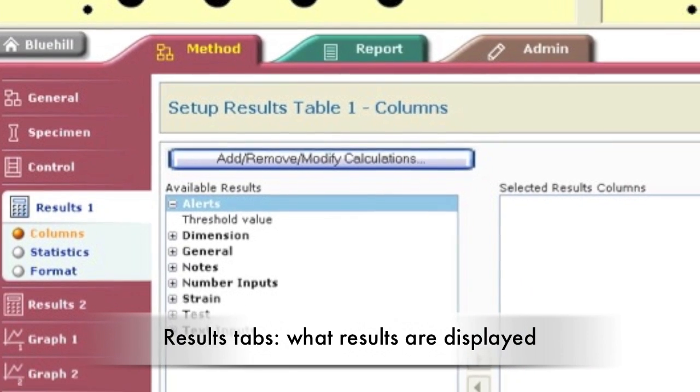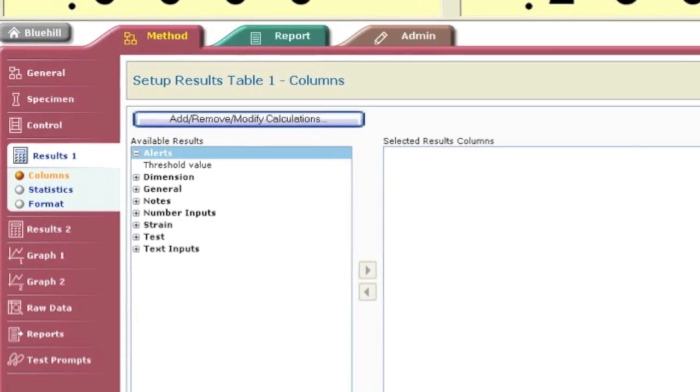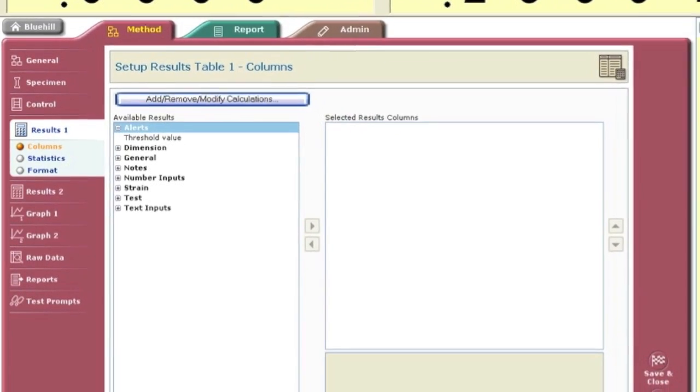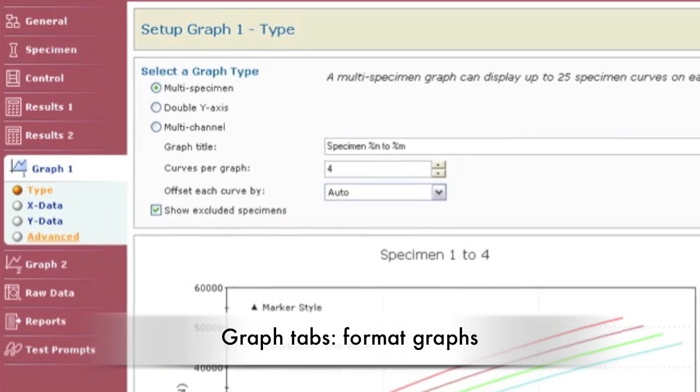The results section specifies what results and calculations are shown. Two tabs are provided to allow for separate result displays. The two graph sections display the results and format the graphs.